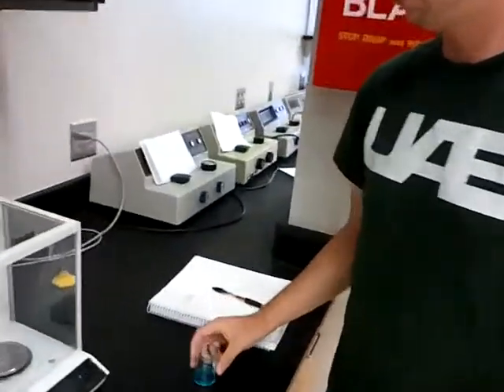Alright, I'll look at the data that you wrote down. This one matches the initial mass of the beaker. This one matches the weight added. Clarity is looking good.